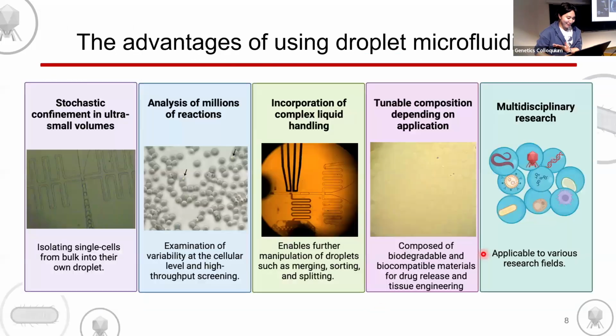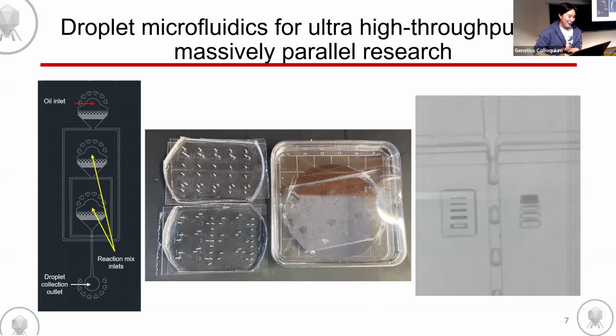Never mind. This was supposed to be a video, a video showing how the droplets are basically generated and pinched off by the oil.